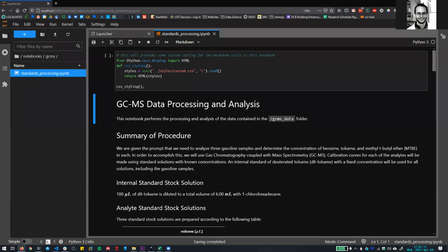All right, everybody. We'll just go ahead and get started, and then maybe more people will join in as we go. So this is going to be a bit more free-form. In the last two lectures, I don't have a PowerPoint or really anything to go over. We're just going to work in a Jupyter notebook together and hopefully try to get through some processing.